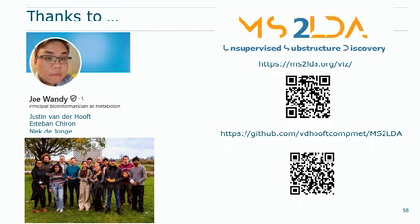Yes, please. I was wondering, because I know MS2LDA is integrated into some other tools, for instance, on the GNPS platform. Okay, perfect. Thank you. Julie from Athens in Greece. From what I remember, MS2LDA is still integrated in other platforms like GNPS and MolNetEnhancer.